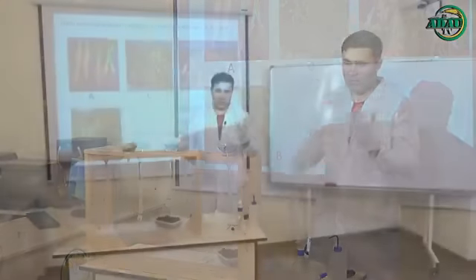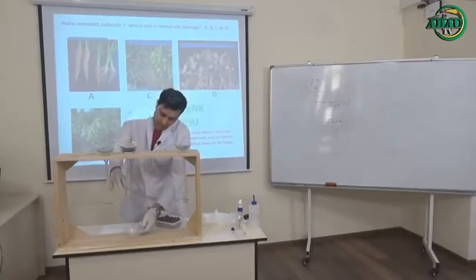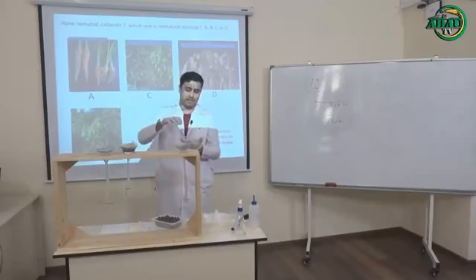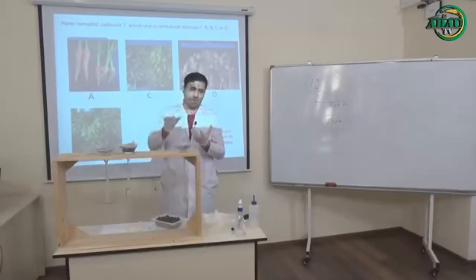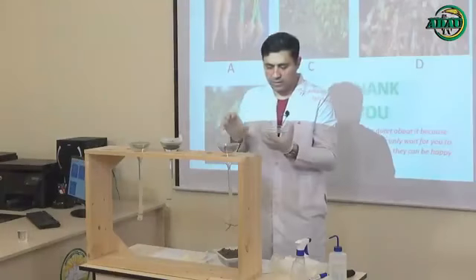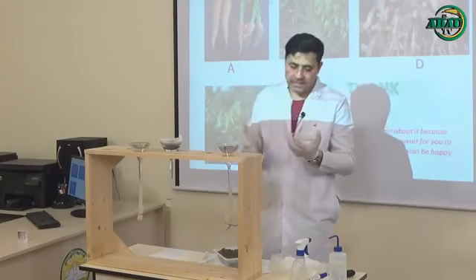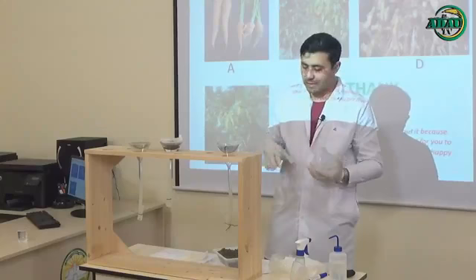Please take note and open the rubber. Add this water inside the dish. And also you can take it part by part, not all this water. It's not a problem, and it will be easier to check all your water.